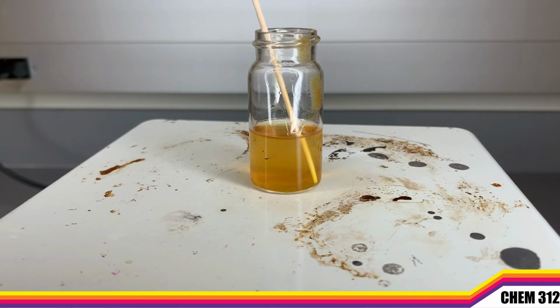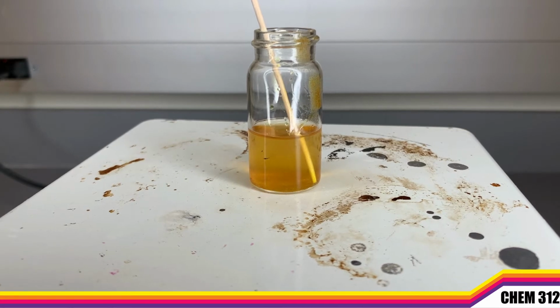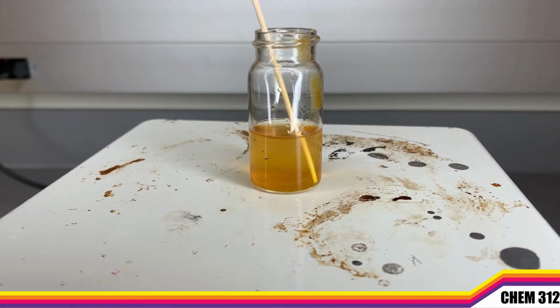We're going to go ahead and heat this and let the reaction get started. Notice that the solution is still kind of brown. It got a little bit lighter, but that might be due to dilution. So we're going to heat this up and see what happens.